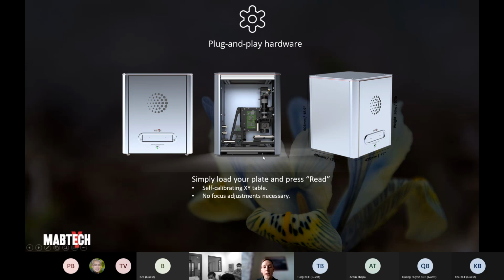So what we have done is that we have created these pre-prepared assay principles. So you noticed when you double clicked on MSIP Clear before you read the plate, then you came into the plate view and the only thing that you had to do was to click on read and collect the information right away. So you can compare that to having to calibrate the table and everything before you start reading.